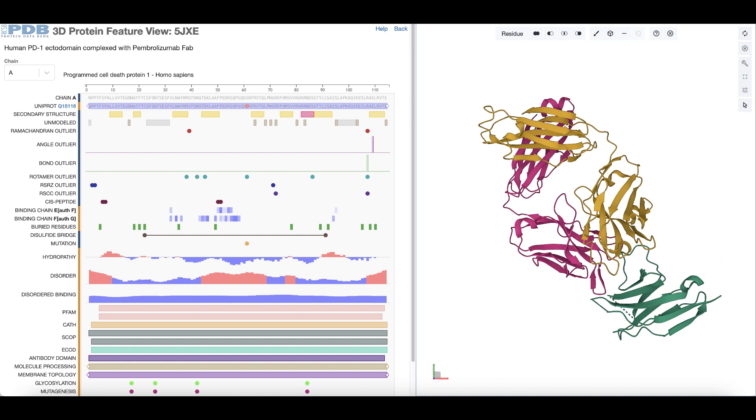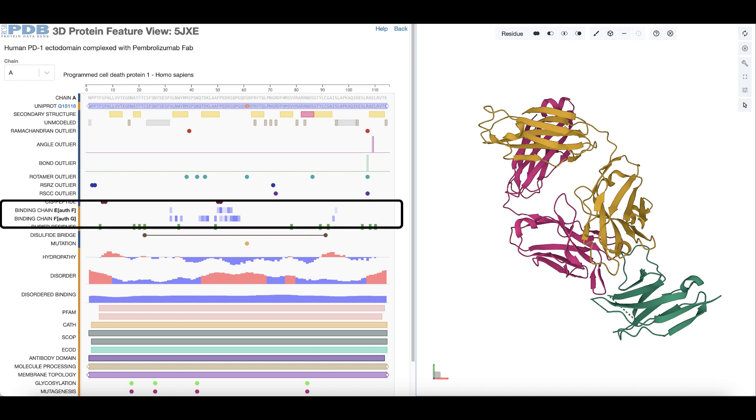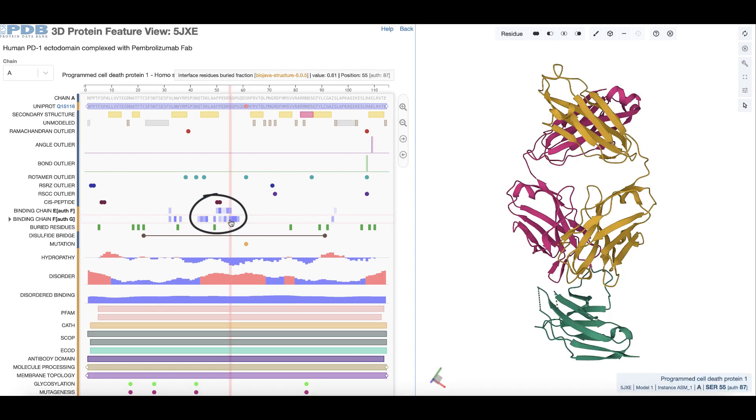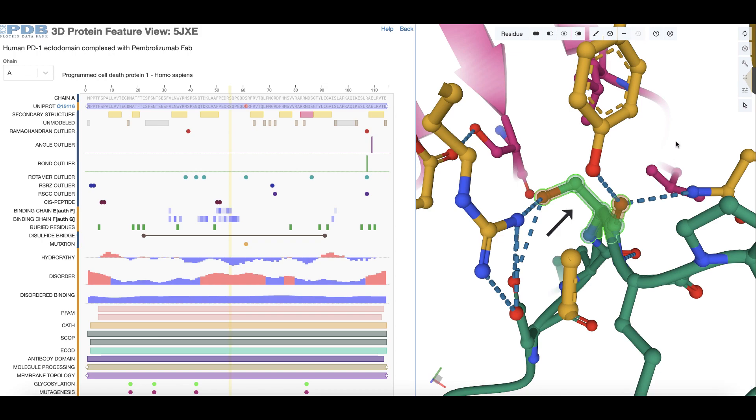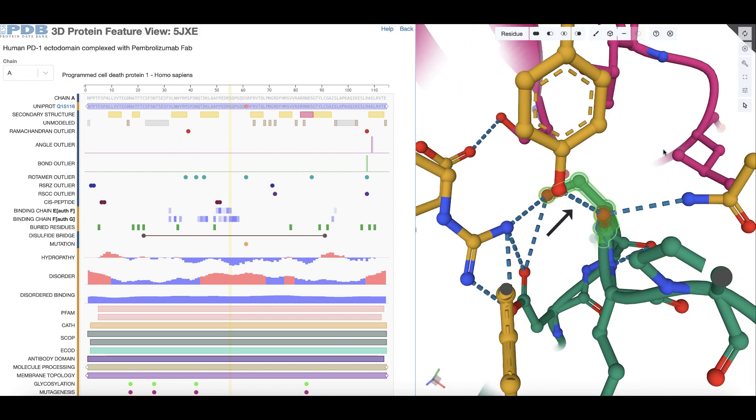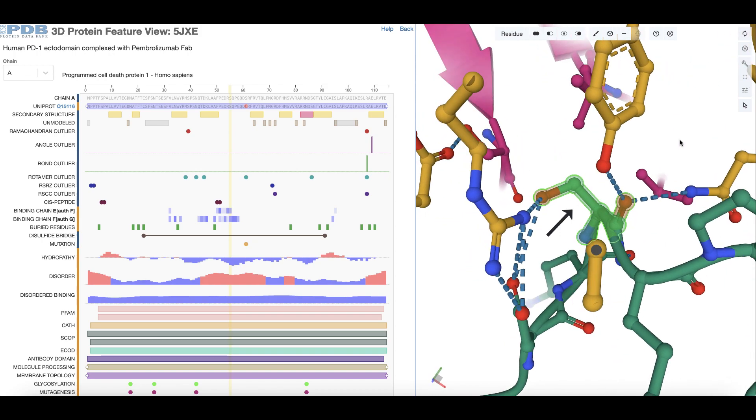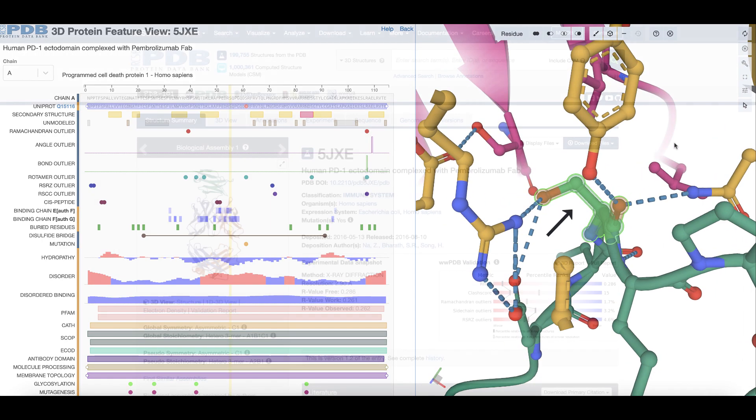For example, to examine the specific residues of the PD-1 protein that bind to the antibody, click on one of the purple highlighted residues, specifically a serine, to see its various non-covalent interactions with the antibody proteins.